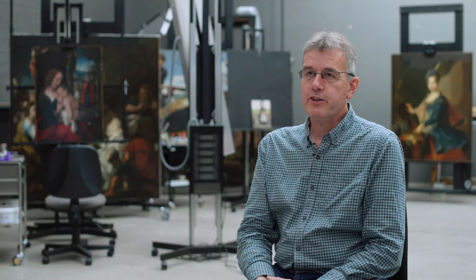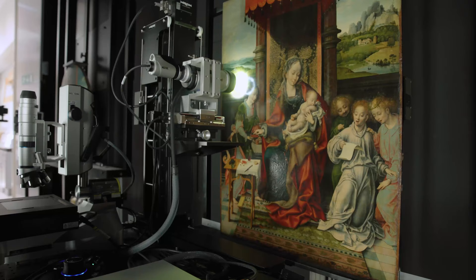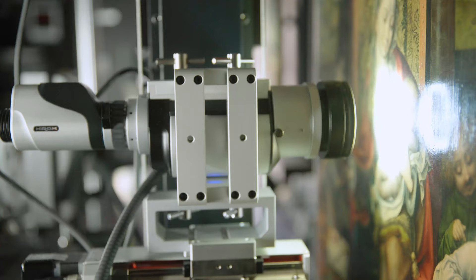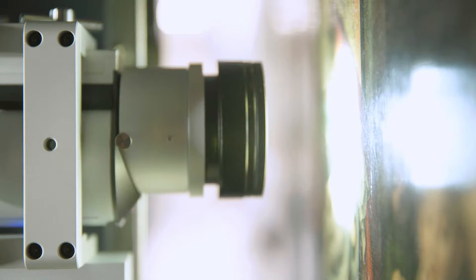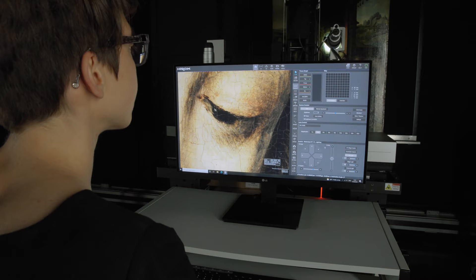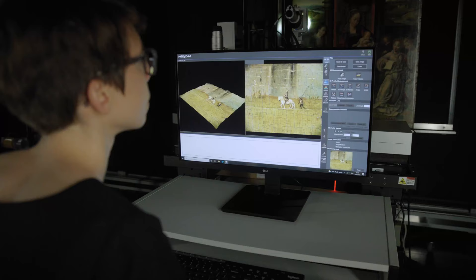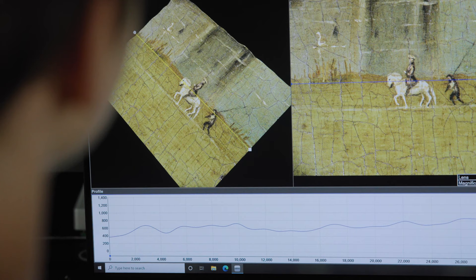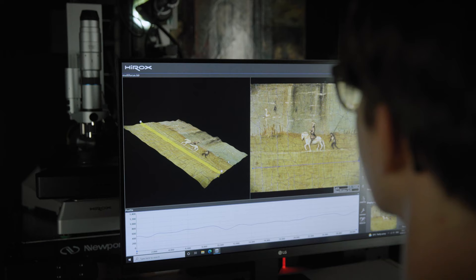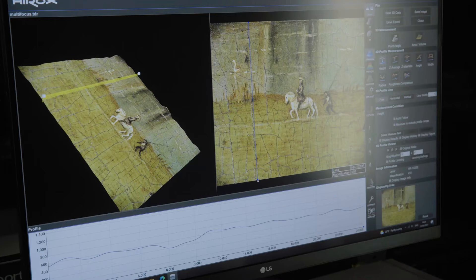The Hirox microscope is a very sophisticated digital microscope that has very high quality lenses, but it also has a very high quality digital camera and lighting system, so that we can get much clearer, sharper, and higher magnification images than we were able to previously. It can show you surface details not normally visible to the naked eye. We can investigate technique and materials, and we can also measure these things because the digital software enables you to measure things on the image. We can also provide 3D mapping of the surface, as the microscope can take a multitude of images at different levels of focus and merge these together, and you can measure the depth of things on the surface of objects as well, which is a very exciting possibility.